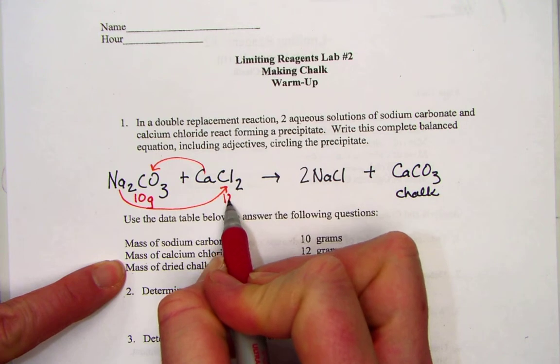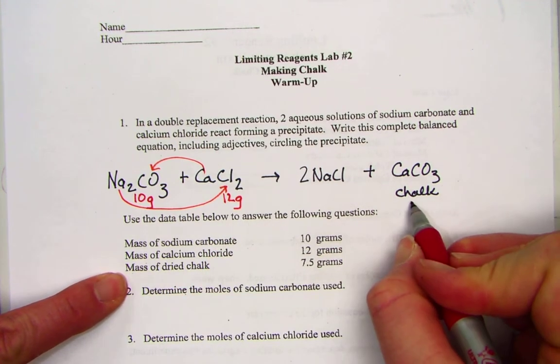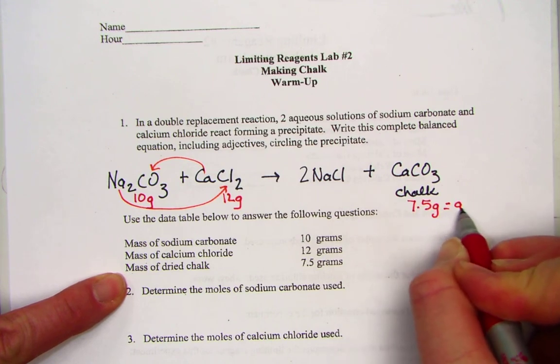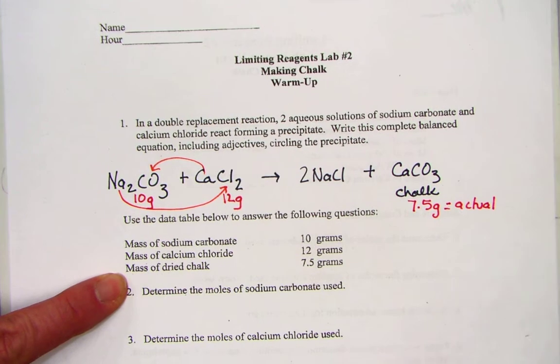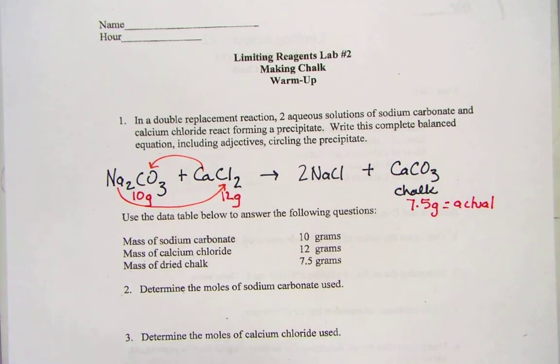Suppose we put that in with 12 grams of our calcium chloride. At the end of the experiment, when we were all dry, we had 7.5 grams. We would know that as our actual yield of the chalk. Given a mass of the two reactants, we will work to determine the limiting reagent and from there find the maximum theoretical yield of our product.